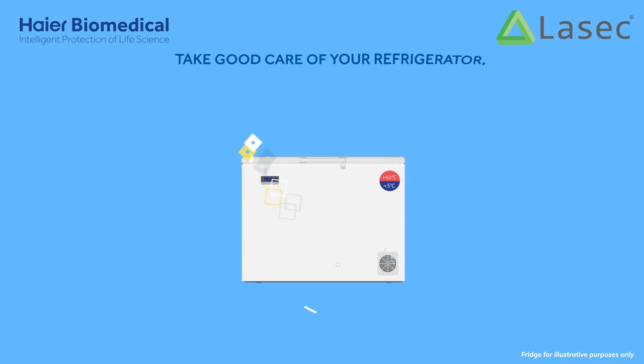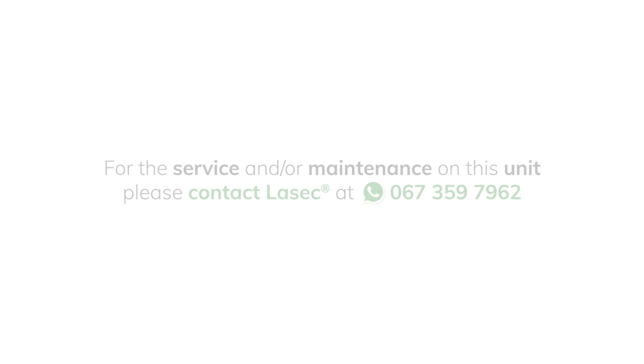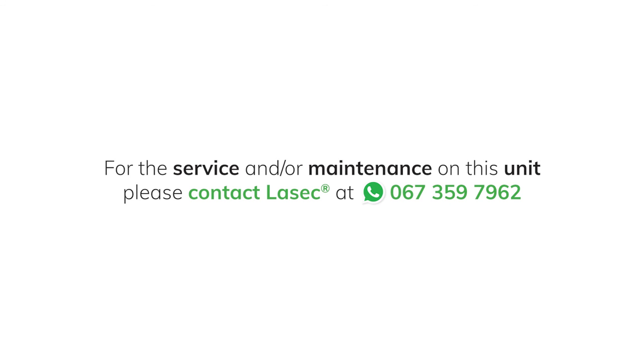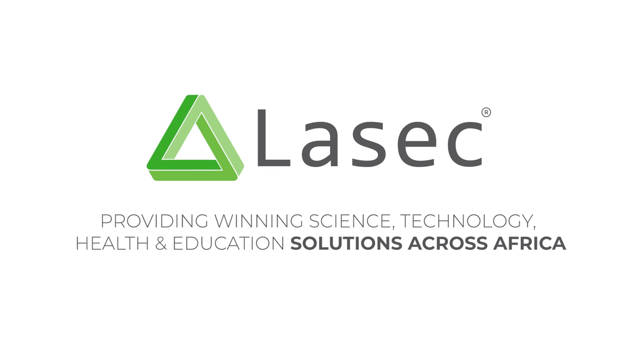Take good care of your refrigerator, just as it takes good care of the vaccines.